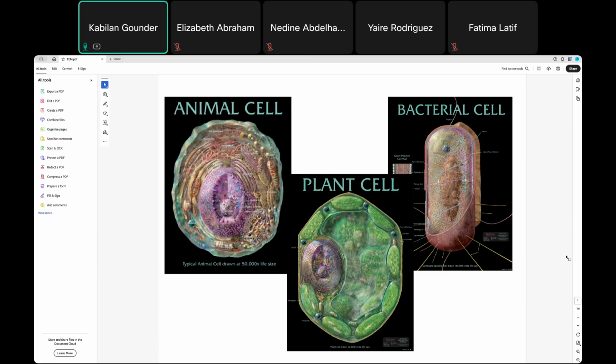So how is high resolution with higher magnification possible? It is because the light source is electrons, and also the electromagnetic lenses and the vacuum, which all together improve the quality of your images.